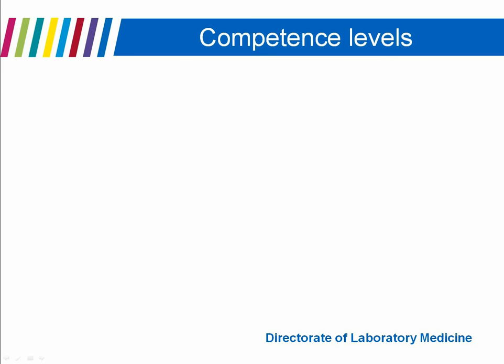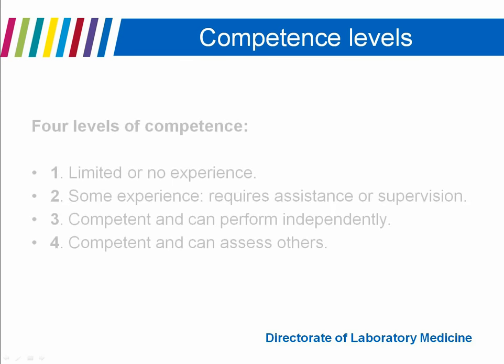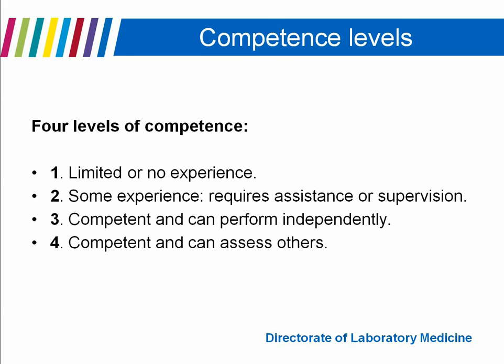We have 4 levels of competence. So from 1 where the individual may have limited or no experience, up to level 4, which covers whether they are competent and can they assess others. You don't have to use this particular approach.